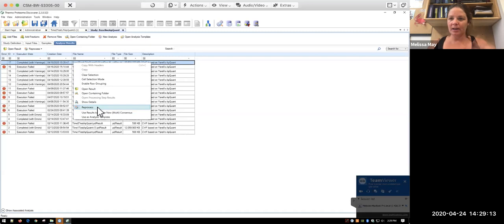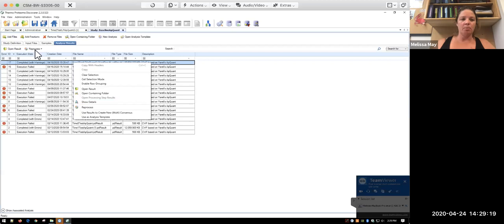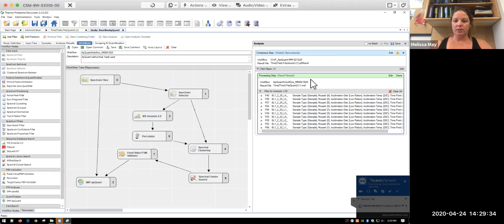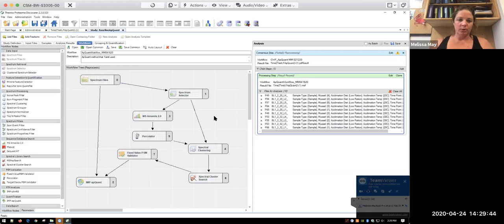So if I wanted to go back in and open up the study and look at it, I can do this a couple ways. I can right click on it and go to reprocess, or I can just click reprocess up here and go to all analysis steps. And what's going to happen is it's going to open up the study that I ran. So you can see now that there's two extra tabs that I have here. And so we want to go into our workflows tab, workflow tabs.